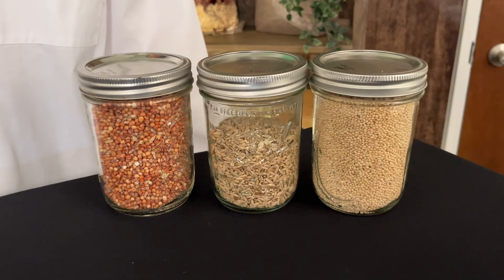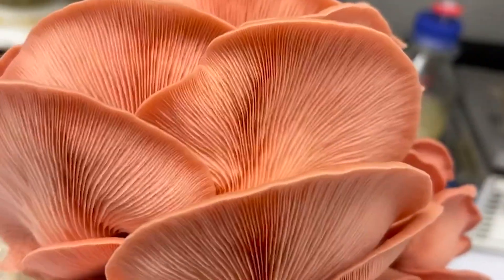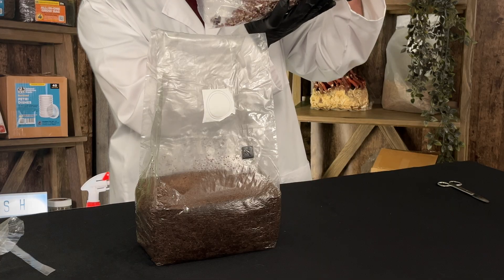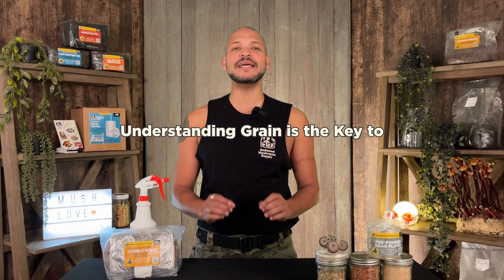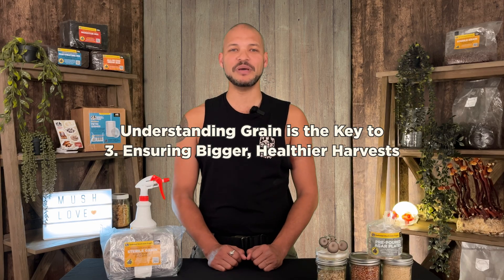Here's what you'll get out of this. We'll cover the basics of different types of grain so you'll know what type is best for different types of mushrooms. Then we'll cover how to inoculate grain using three different methods: liquid culture, agar, and grain-to-grain transfer. Finally, we'll show you how to expand colonized grain into bulk substrates like wood, CVG, dung-loving mixes, and straw. Understanding grain is the key to avoiding contamination, speeding up colonization, and ensuring bigger, healthier harvests.